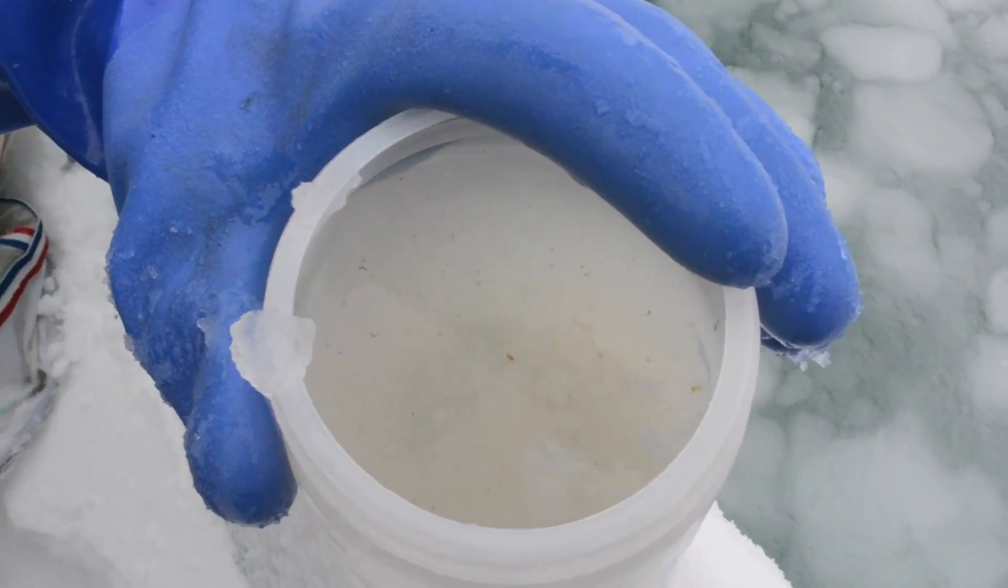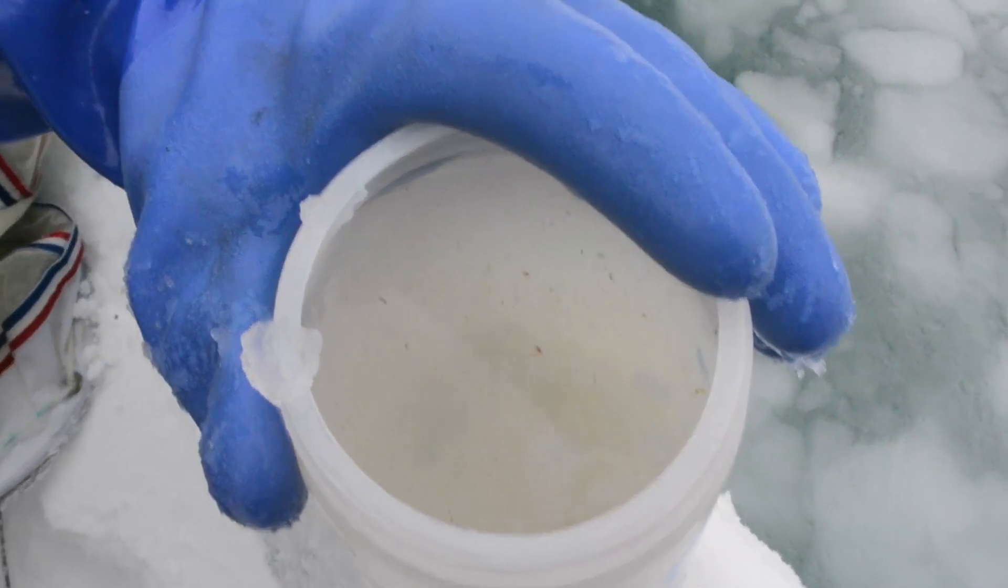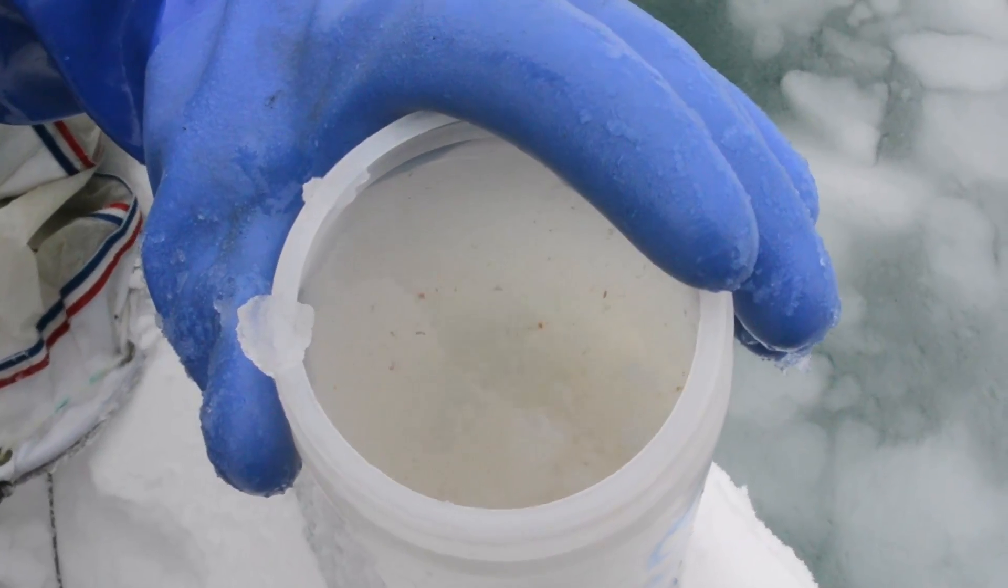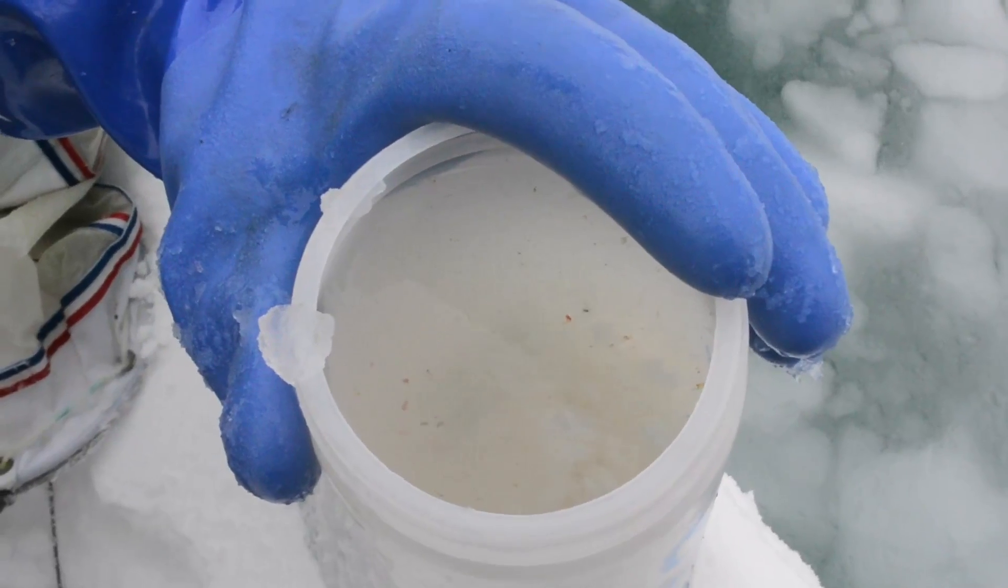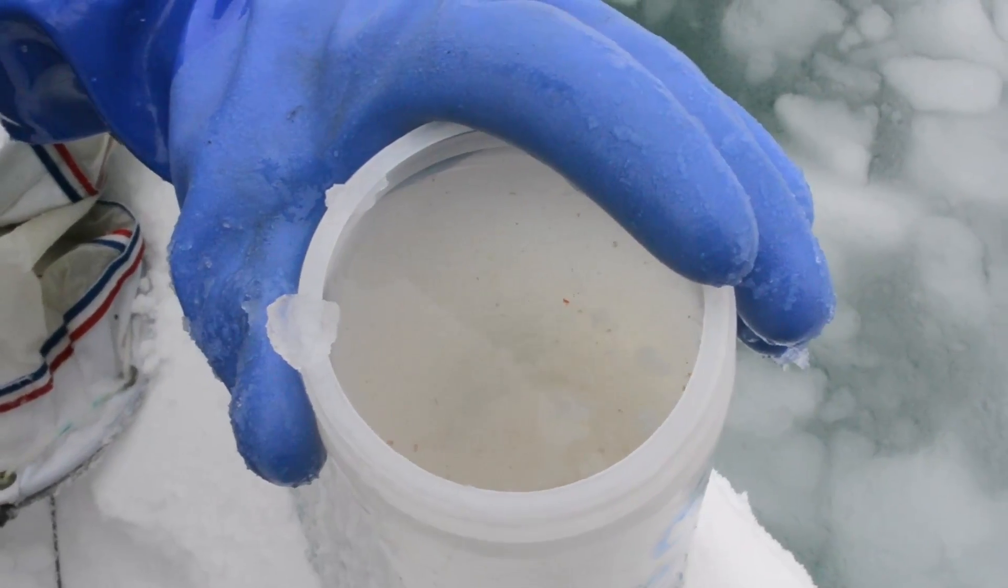The things that are swimming around are probably copepods and amphipods, and then the phytoplankton you really can't see. I'm going to have to take it inside and put it under the microscope in order to see what we have in terms of phytoplankton cells.